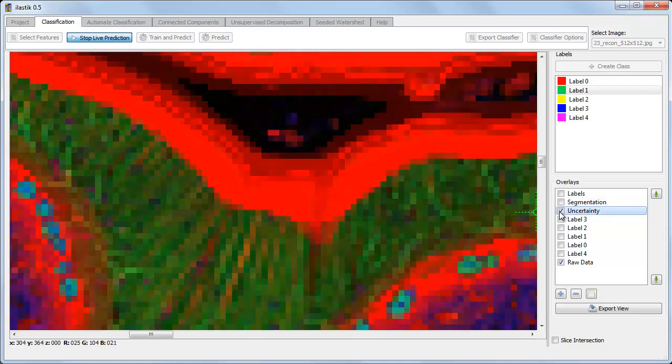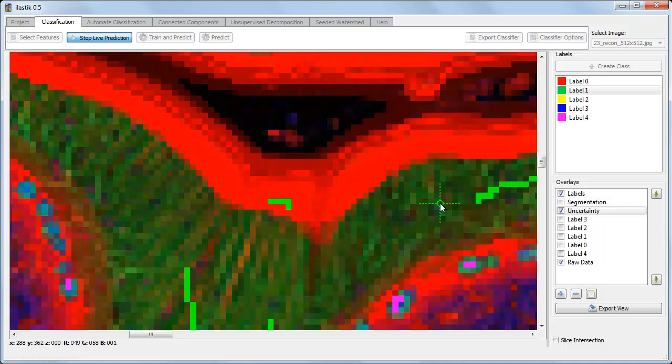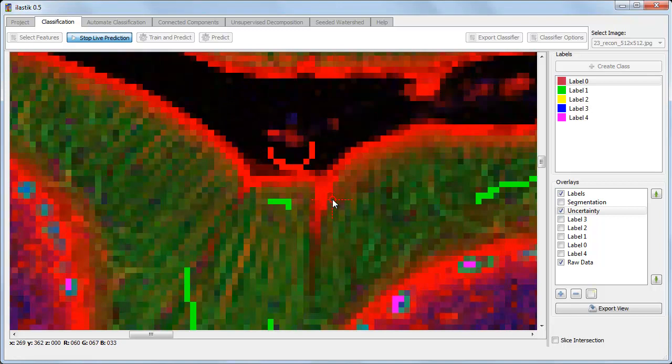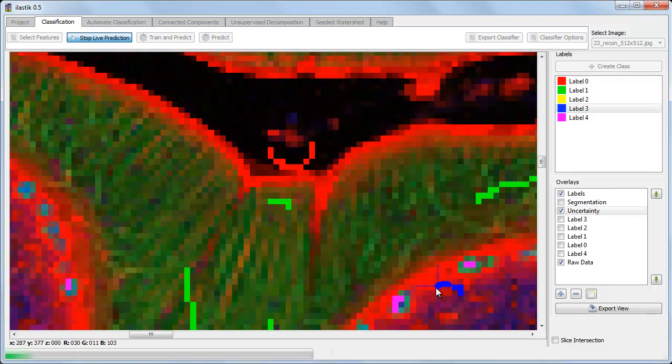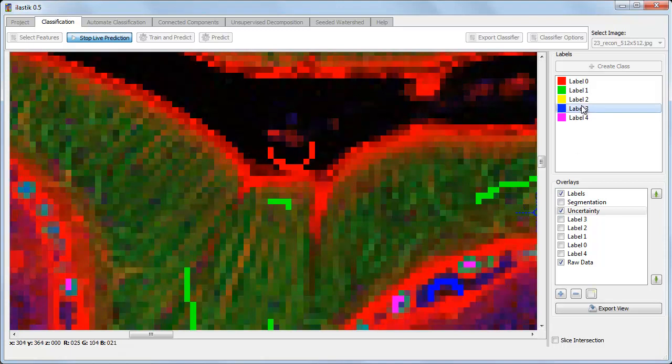It looks like it's most confused around boundaries. So let's label some more of these green pixels, and some more of the background. Looks better along the boundary there.